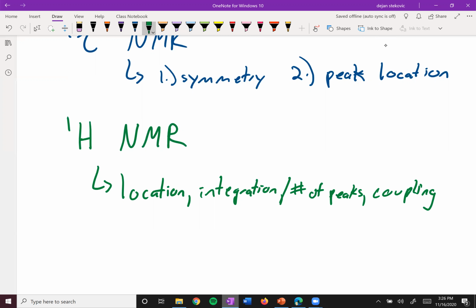And for the coupling, you really want to focus on the patterns that we've seen a lot. If there's an isopropyl, you should be able to look at it and figure it out just like that. Oh, I see an ethyl there. Oh, there's a propyl there. Oh, there's a methyl there. Oh, there's a tert-butyl there. You got to be able to see these things and be able to see them relatively quickly.